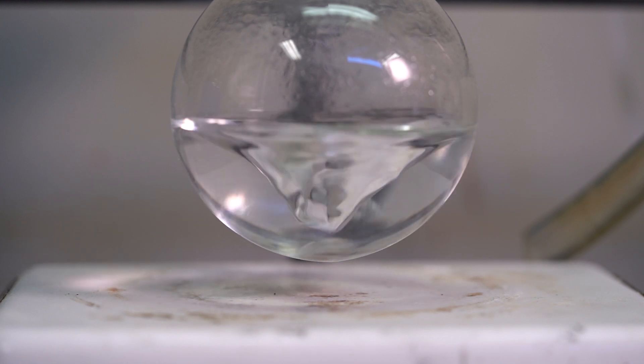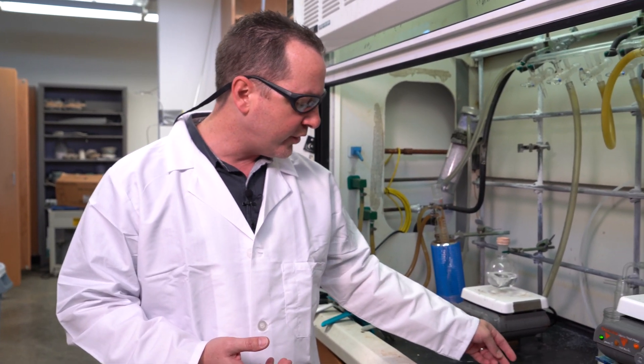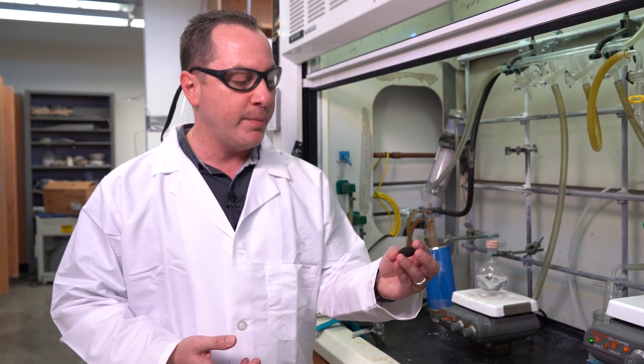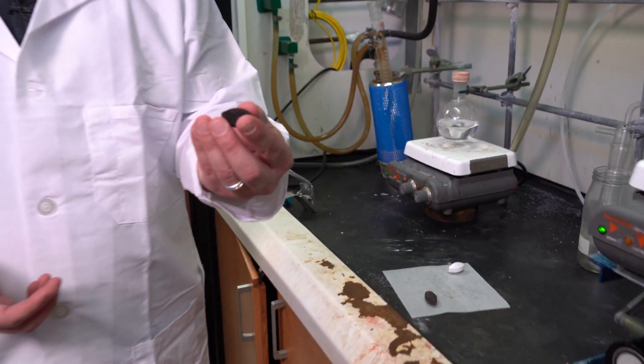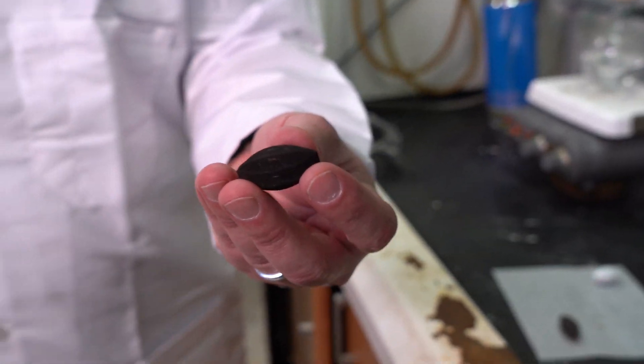What we found out is that when we perform the Billups reduction using these Teflon stir bars, they will become black, which is something that was unexpected.